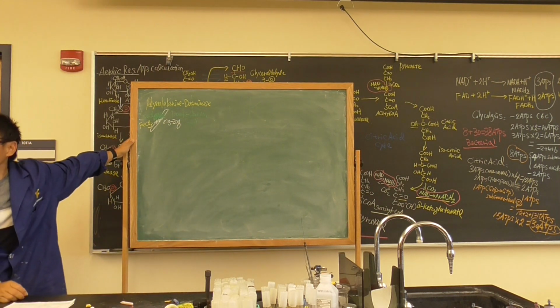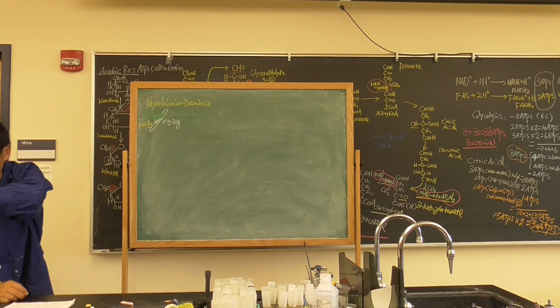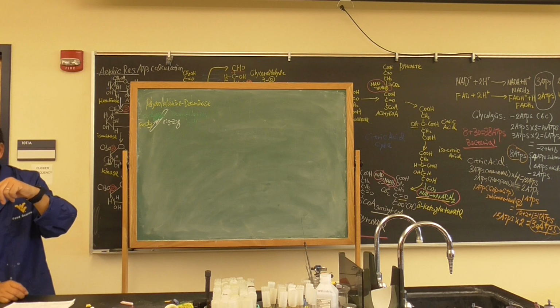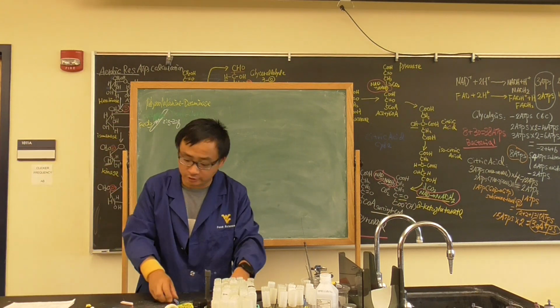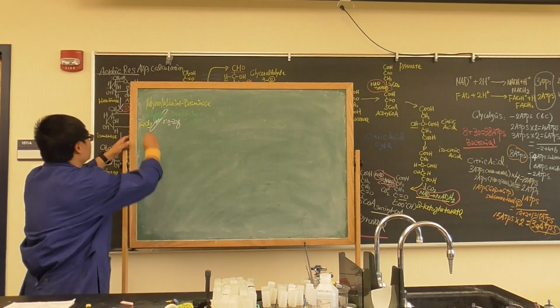Okay, can you go ahead and do it? Don't forget the confirmation test that you're going to do by yourself. You tell me which one is positive. We'll go over it next week, Tuesday. We used to have everybody add one drop, but now you have to do it. All the reagents are there. Okay, this is a review.